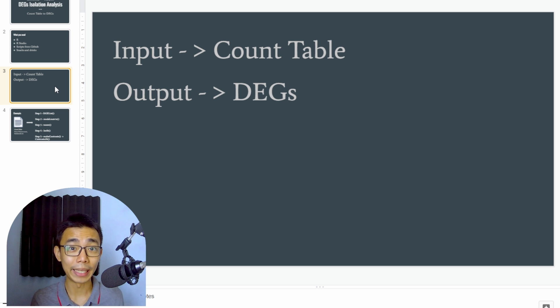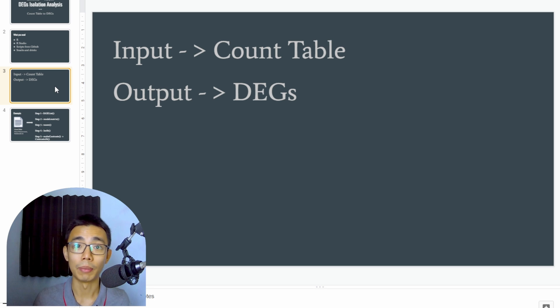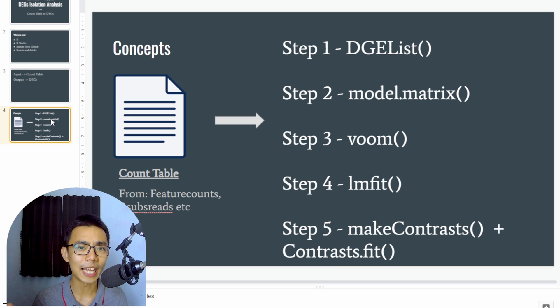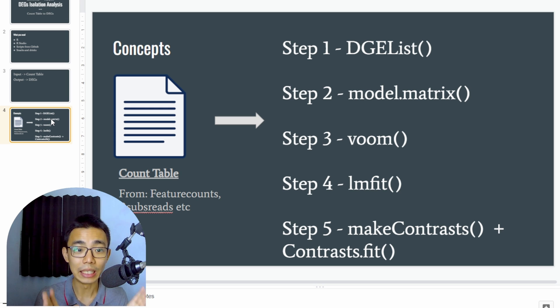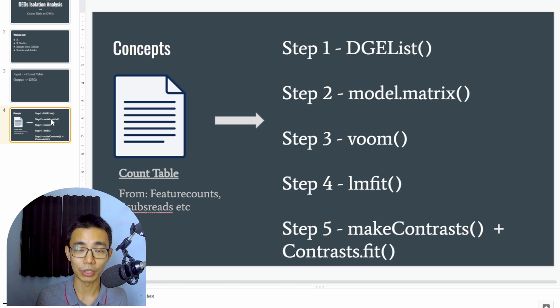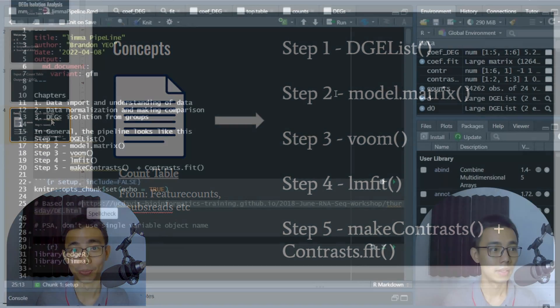This analysis takes a count table as input and generates a list of DEGs. In the limma-voom pipeline there are five main steps: creation of a DGE list object, creation of a model matrix for your experimental design, fitting into a voom transformation, fitting a linear model suitable for RNA sequencing analysis, and then running makeContrasts and contrast fit to isolate the DEGs. Let's move on to RStudio.